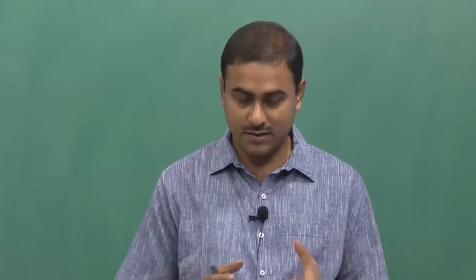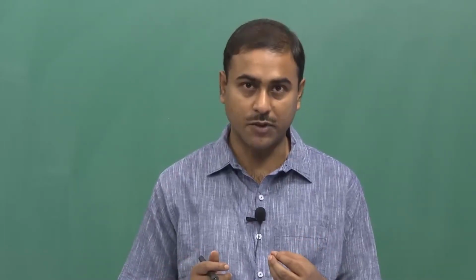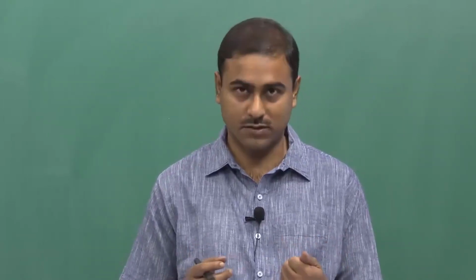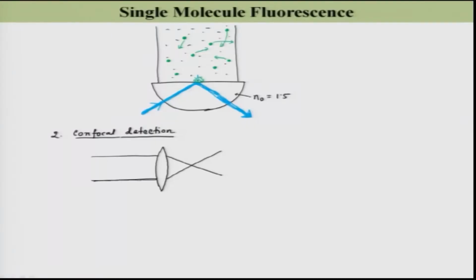So, in all these experiments, to achieve a small observation volume, the light source being used is the laser, because with a conventional light source you cannot focus so tightly. In this case you will get diffraction limited focusing. Now, this is very much applicable. Let me show you another version of this geometry. It looks something like this.